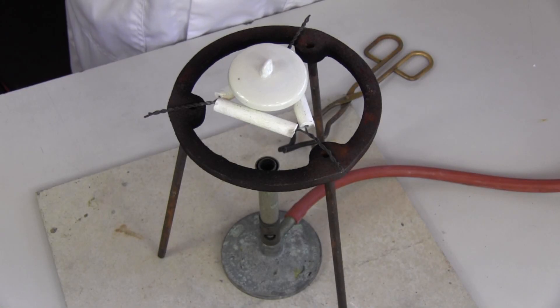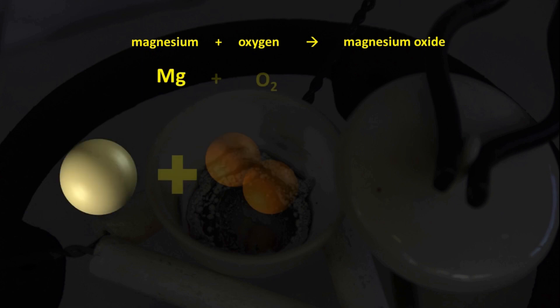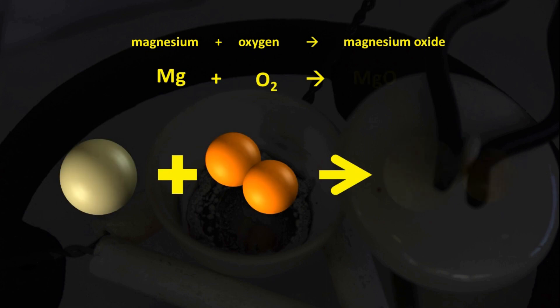The chemical equation for the reaction is magnesium plus oxygen produces magnesium oxide. Mg plus O2 produces MgO.